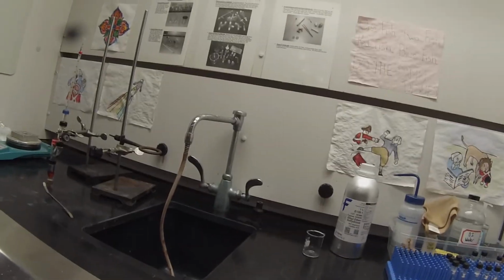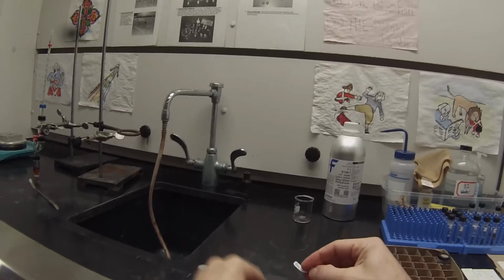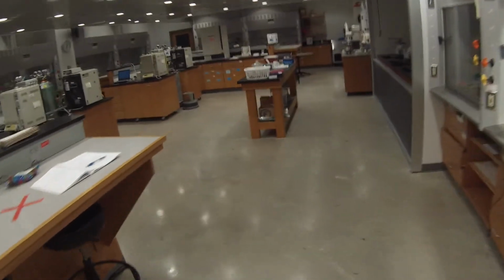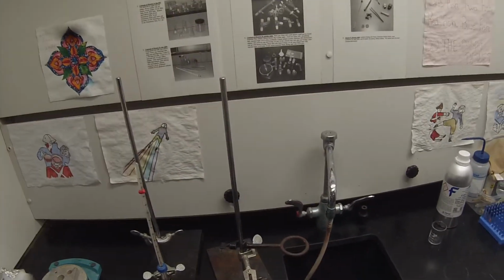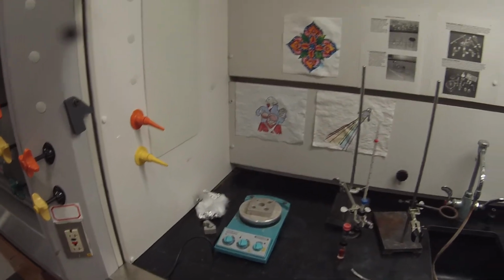Making sure the Teflon side is down toward the product. And that liquid is 47A. And that'll store in the freezer. I have the GC mass spec started up. So tomorrow or later can be ready for getting GC mass spec data on this guy.